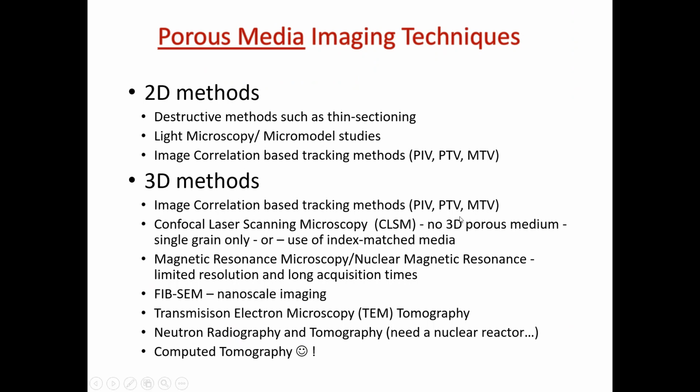Now, 3D methods. These methods can be done in 3D if the porous medium itself is transparent, just like in those glasses. You have transparent gel beads, and then there's glass moving through. Some of the porous medium here is transparent, which in reality we never have, but some of the models, those we refer to as models, basically make the solid transparent so I can monitor what's going on in the pore space.